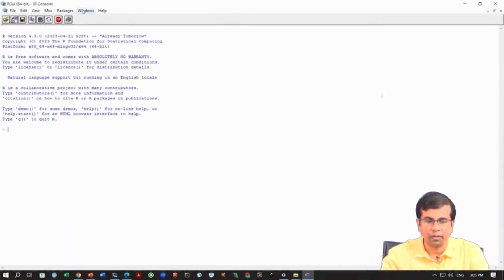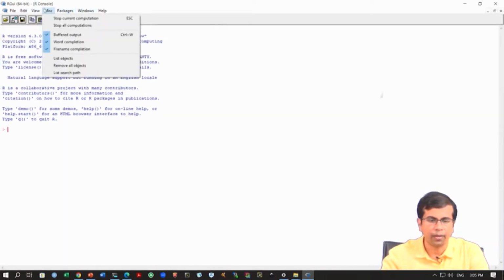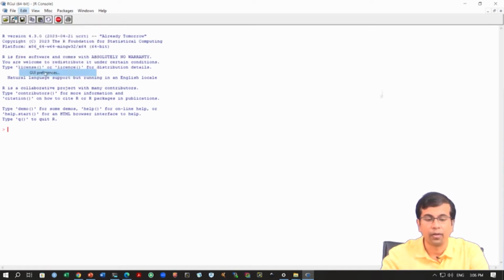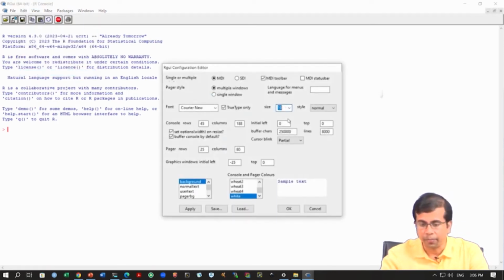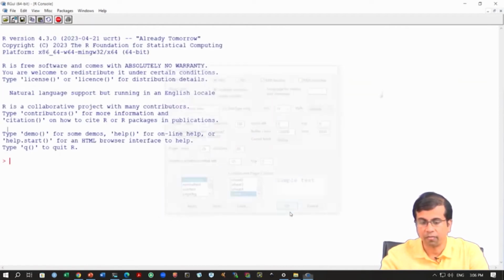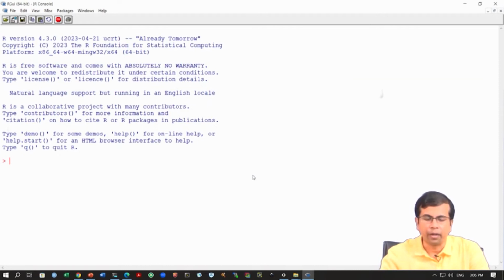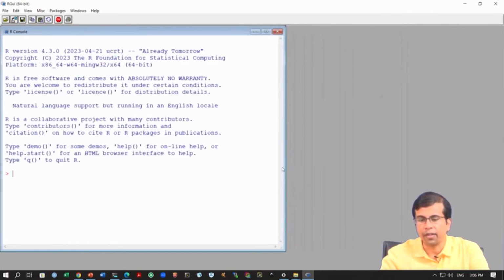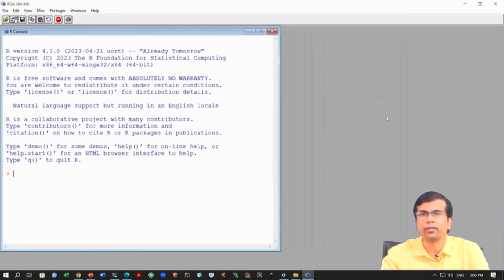I can make it slightly bigger, and then we can probably see this better, and here it is, right. Okay. So, this is bigger now. Once I run the codes from here, the plots will also be generated side by side. Okay. So, I can see the plots in this part. That will be very useful, right. So, I can see and change the plots and the outcomes that we see if I want to.